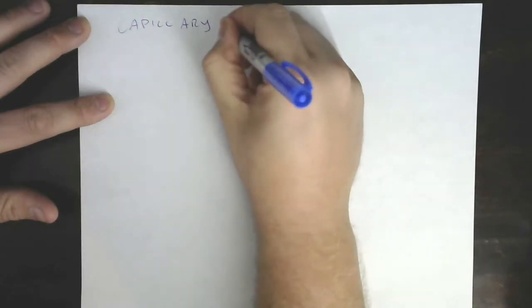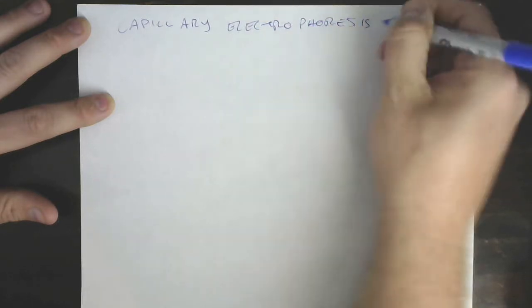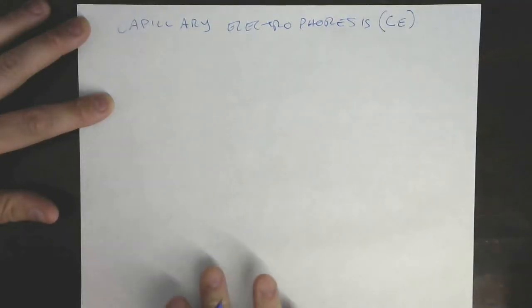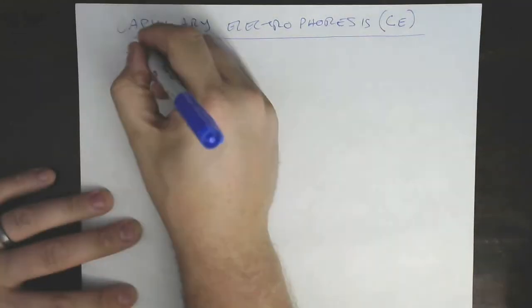Capillary electrophoresis, or for short, because that's a lot to write out, CE. Okay, so let's start this by recapping the two mechanisms that we discussed last time.